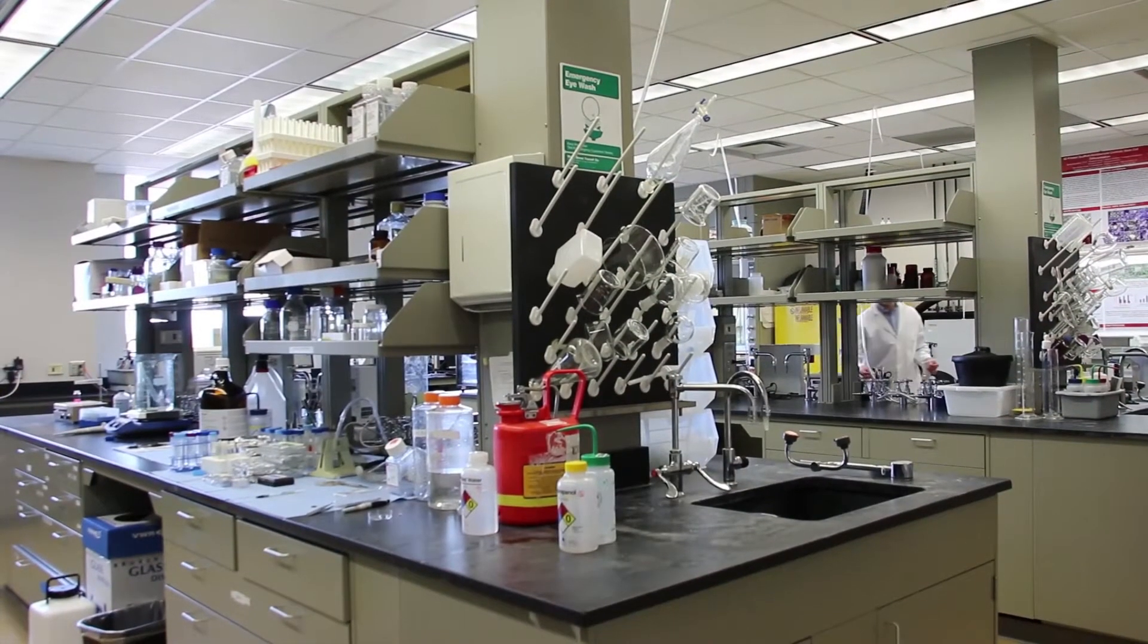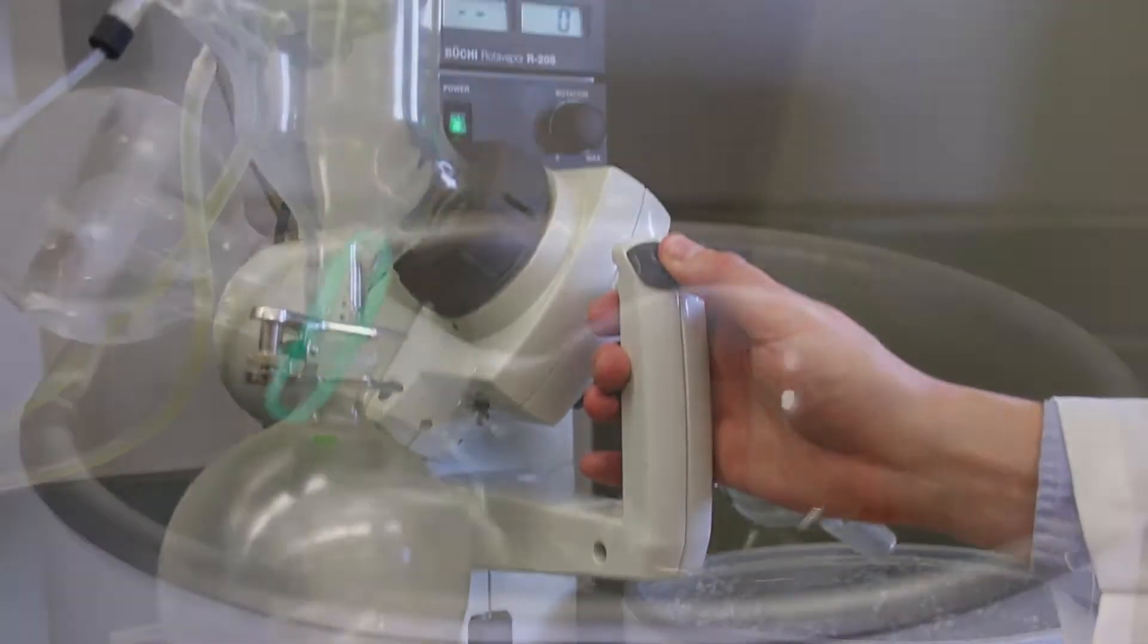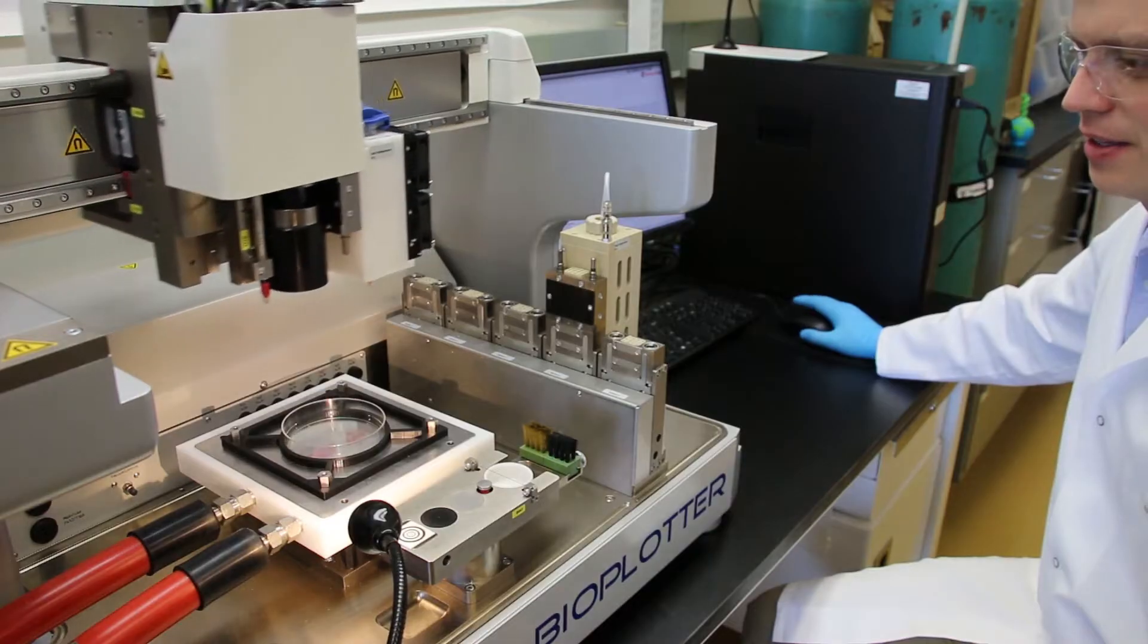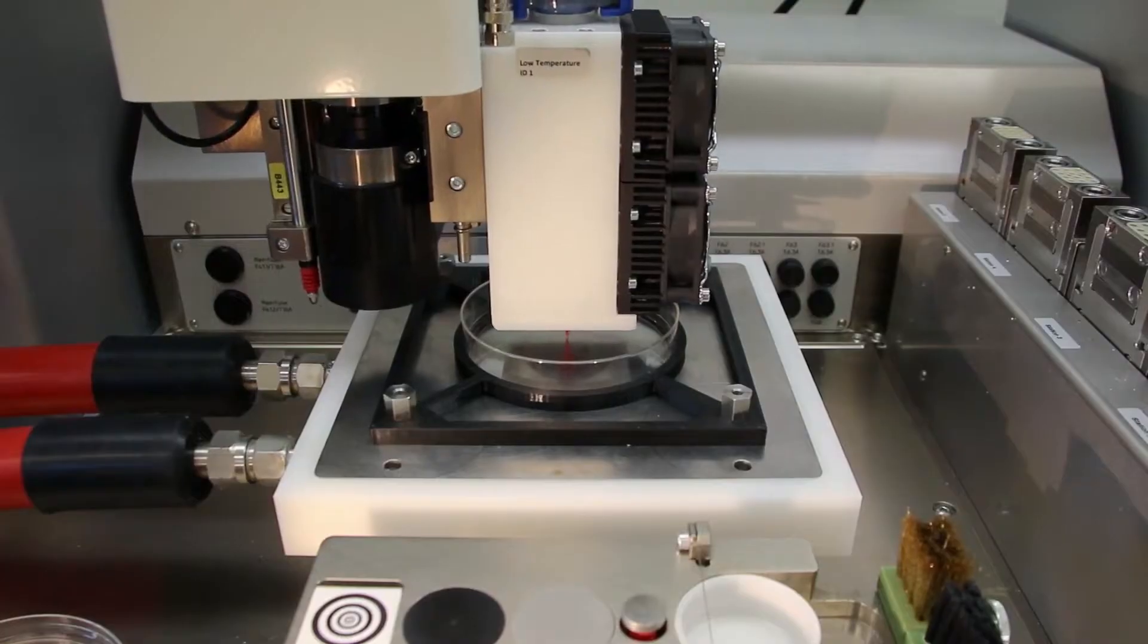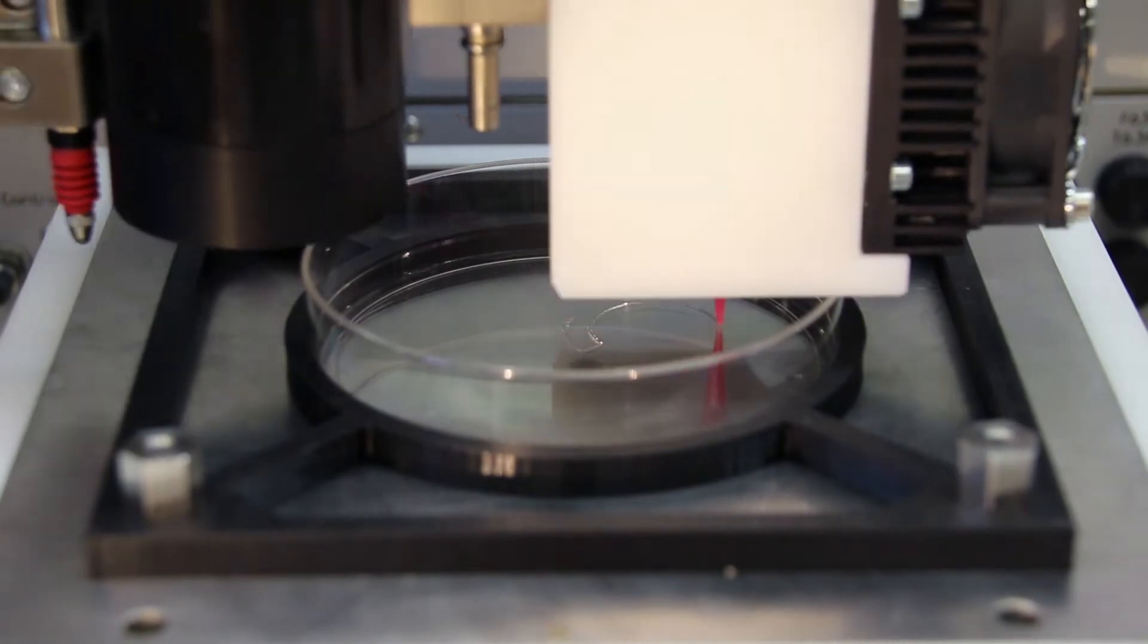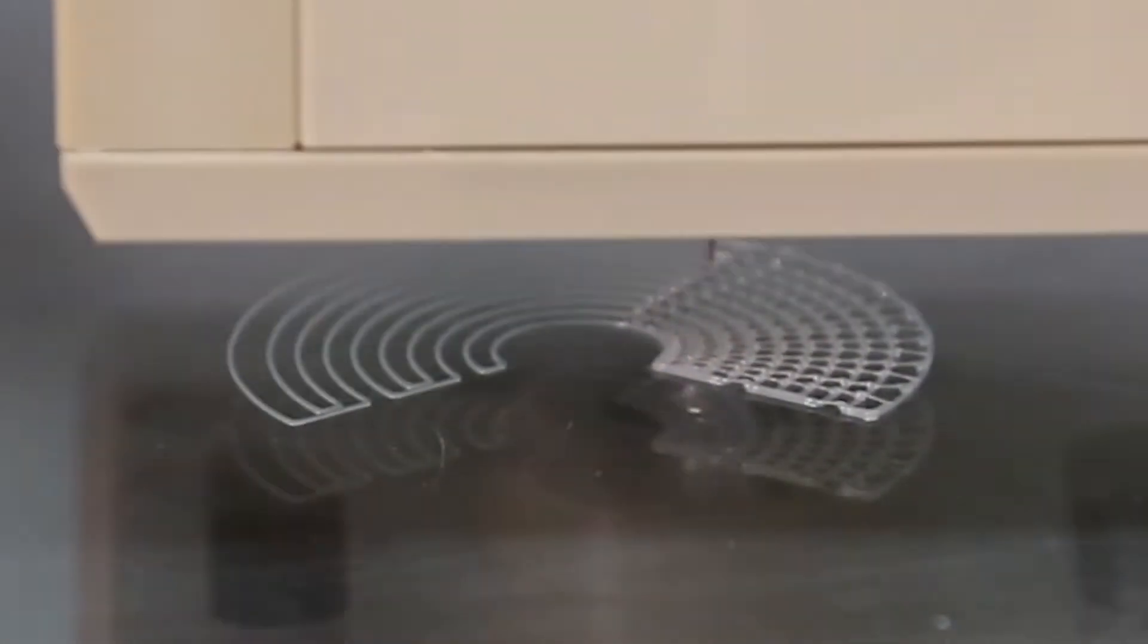This is our prototyping lab. Here we have our EnvisionTech printer. We are developing new materials. We are looking at the use of 3D printing to shape scaffolds for tissue regeneration and regenerative medicine.